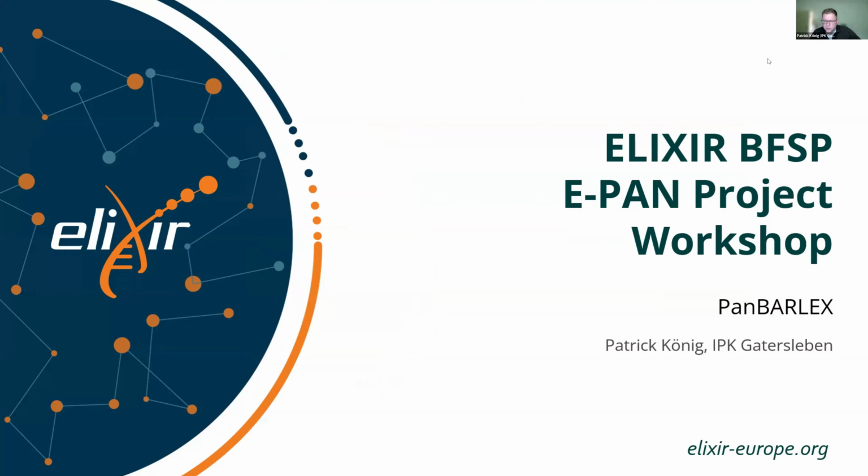Okay, yeah, I will talk about our tool PanBARLEX, which is specially for barley, for the pangenome of barley. So it's not a generic tool.